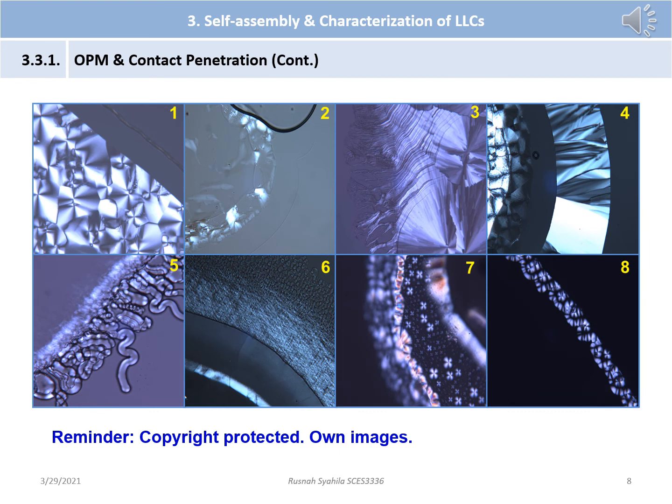These are examples of liquid crystalline phases in contact with solvent. 1, cubic phase with a clear border. The material is not soluble in water. 2, cubic phase with no clear border. The material forms cubic phase and dissolves in water forming micellar solution. 3, inverted columnar phase. 4, showing polymorphism with different concentration gradient. 5, myelin texture. 6, hexagonal phase in between 2 different types of cubic phase. 7, lamellar phase. 8, hexagonal phase.